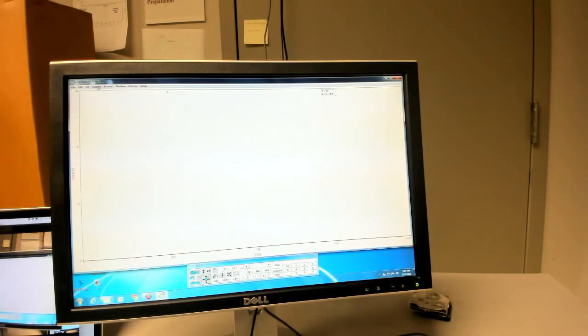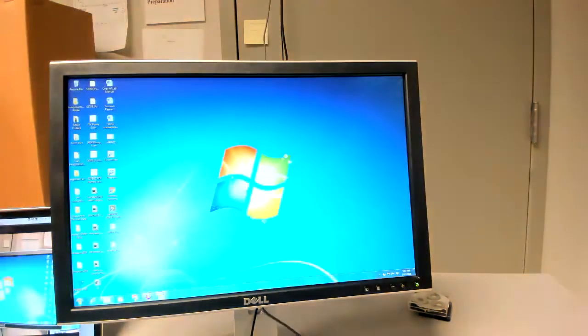And we don't need to do anything here except the following. We're going to go to Set. We're going to turn on Auto Background Subtraction, either one, Dynamic Background Image before. What this will do is when the CCD camera runs, it will take a dark image before it takes the sample image. I'm going to minimize this window now.